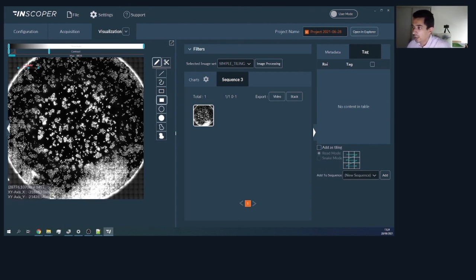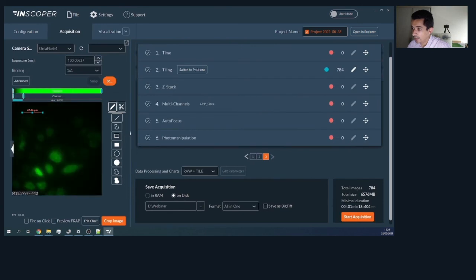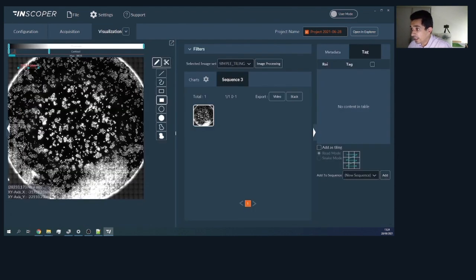In fact, we can also see a specific part of this tile live, for example. Here you can see we can also apply a LUT, a specific LUT for the image. And then I want to show you an example. I will generate another tile from that one.